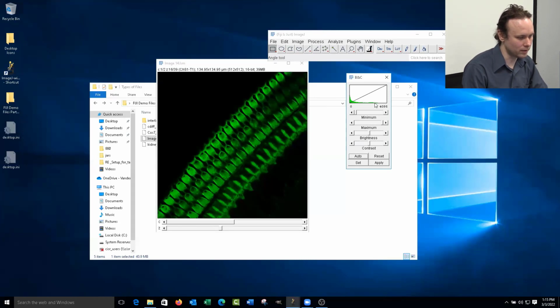And what we have here is the histogram. So this is showing the brightness of all the pixels in the image. And essentially, we want to make sure that we are accurately representing what we have. So right now, we are showing the full window. We could adjust this two ways. So you can directly adjust brightness, contrast. Brightness will make it brighter.